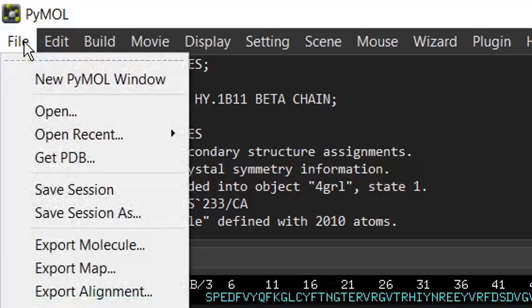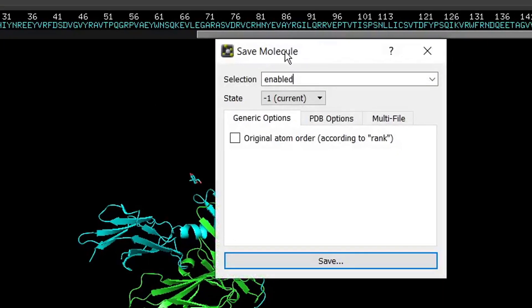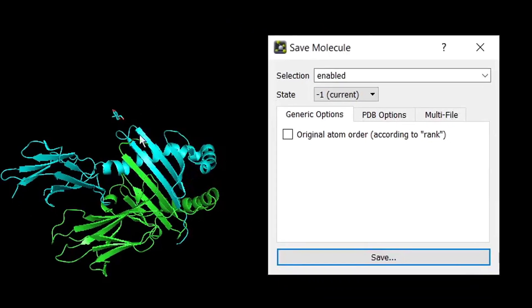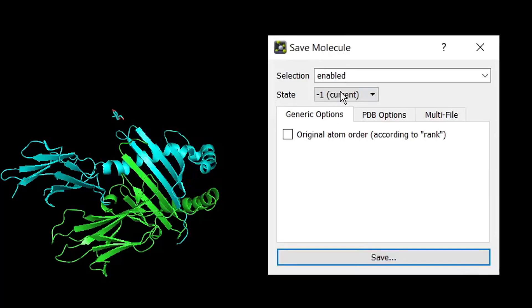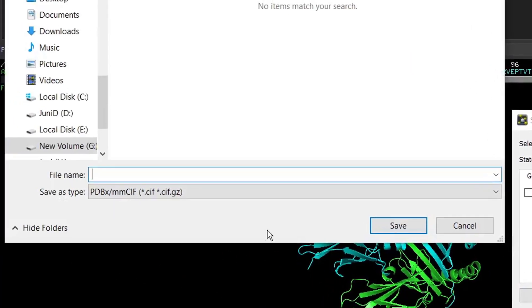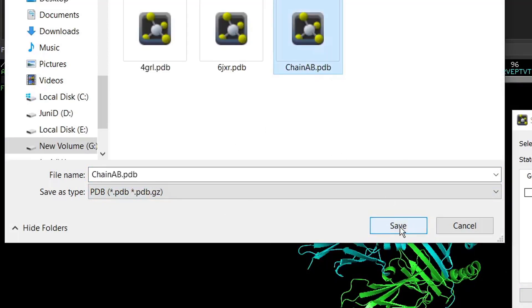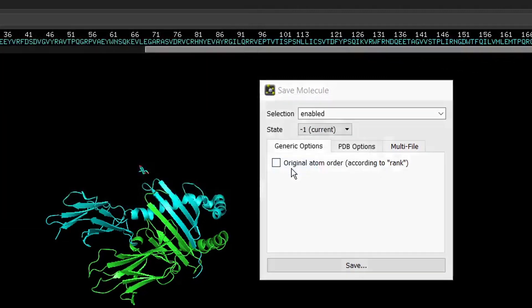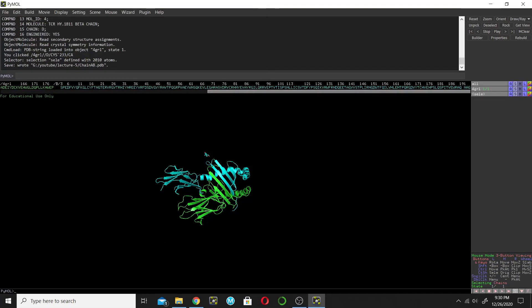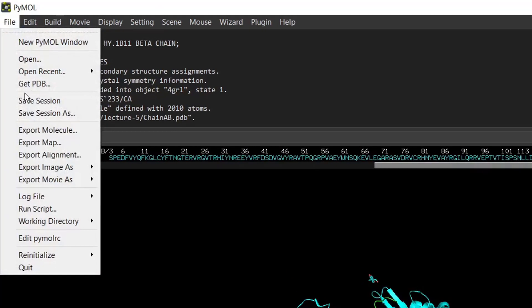Now save this protein by going to the File menu and clicking Export Molecule. There are only two chains in the PyMOL window, so no need to change the selection — click Save, change the format to PDB, and name the file 'ChainAB'. Click Replace to overwrite.